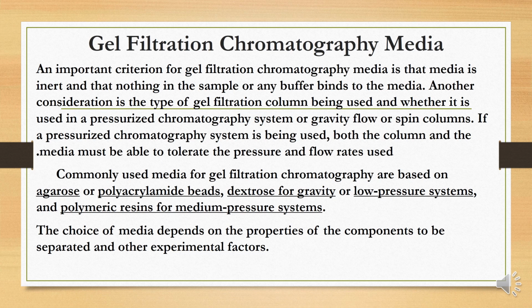If a pressurized chromatography system is being used, both column and media must be able to tolerate the pressures and flow rates used.